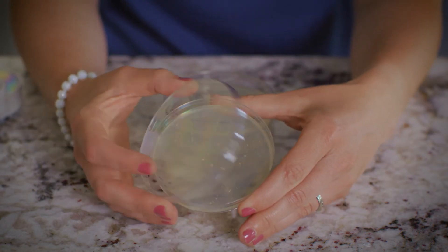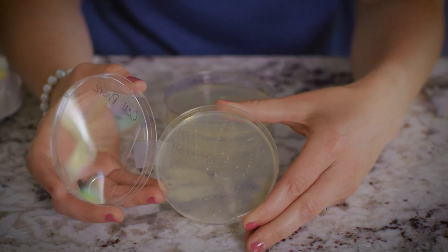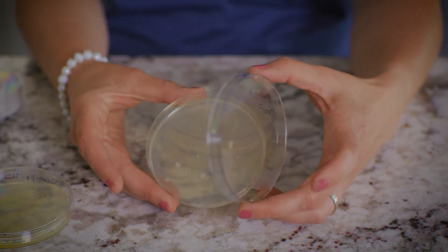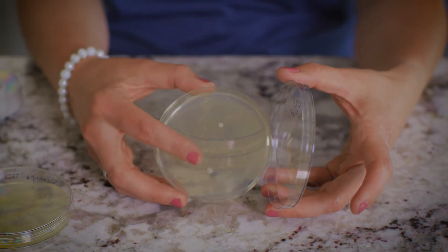Let's look at my cell phone. Can you see those spots of growth in there? Next is the kitchen floor. Let's take a peek. There are some bigger spots in there. Do you see those?